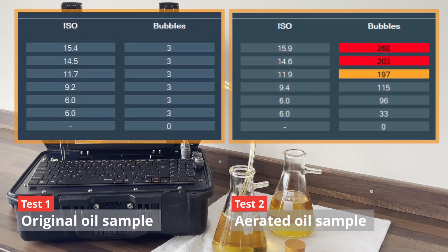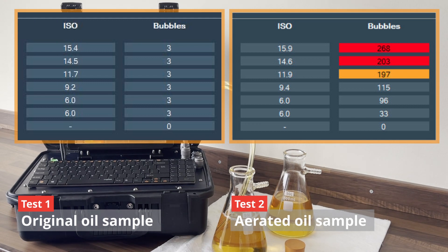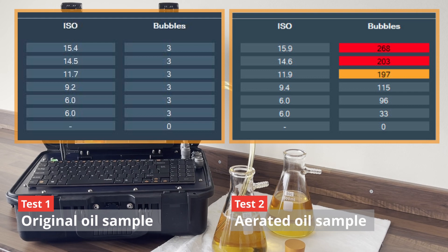As expected, the results are the same as we had on the first sample, and as we can see it's even counted the bubbles and categorized the size. This demonstrates the Particle Power Pro eliminating the air from the results.